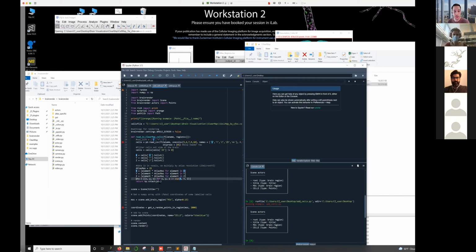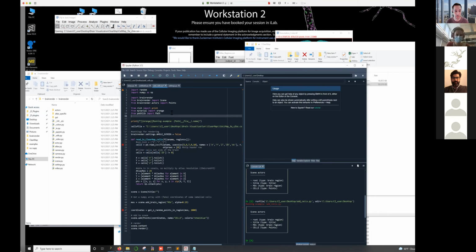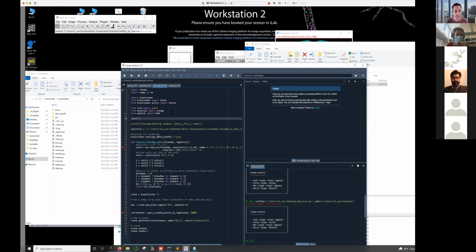And then finally, these two lines here are just some lines from the BrainRender scripts to make some points that are recognizable for plotting. So just include these in the function. We've got an error here. This is probably because it doesn't know what pd is, since we haven't imported pandas. So that's just a case of importing that at the top. Somewhere in here, you should just import that. So that's import.